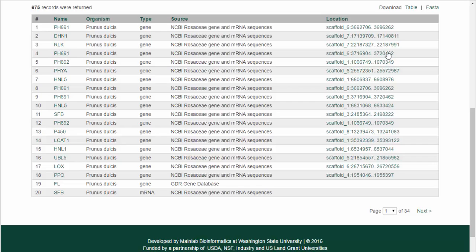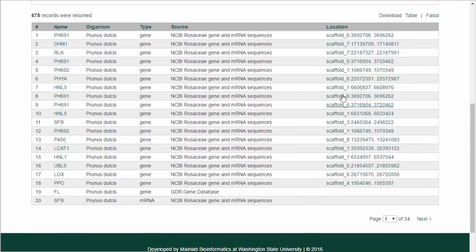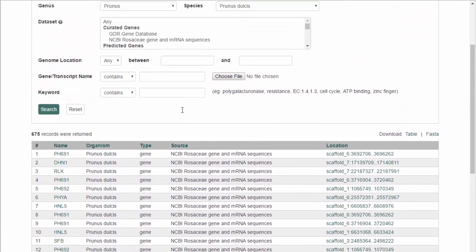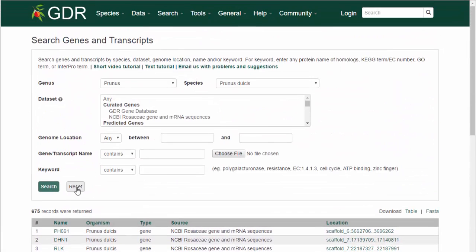The table can also be downloaded, and a FASTA file of the returned sequences can be downloaded. To do another search, click Reset.